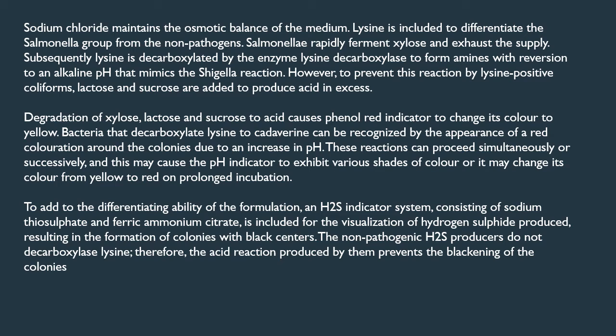Degradation of xylose, lactose and sucrose to acid causes the phenol red indicator to change its color from red to yellow. Bacteria that decarboxylate lysine to cadaverine can be recognized by the appearance of a red coloration around the colonies due to an increase in pH.